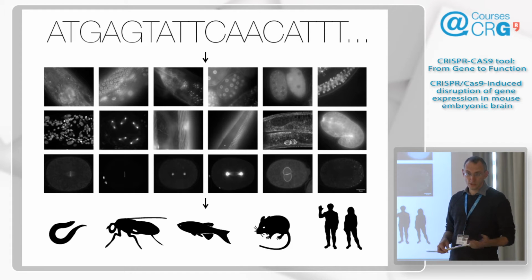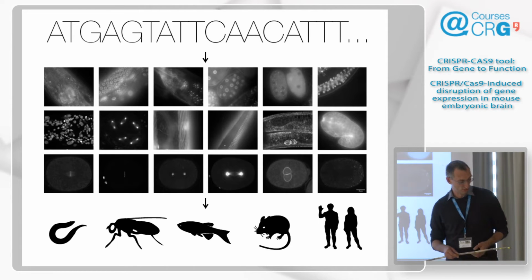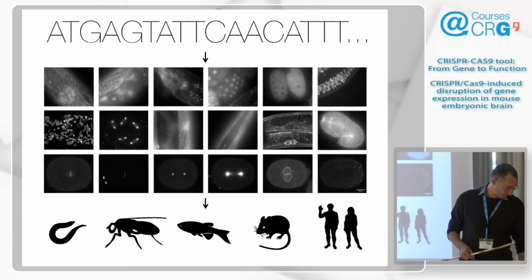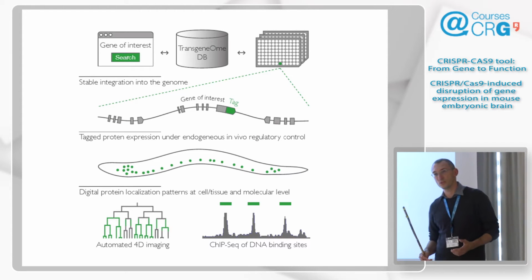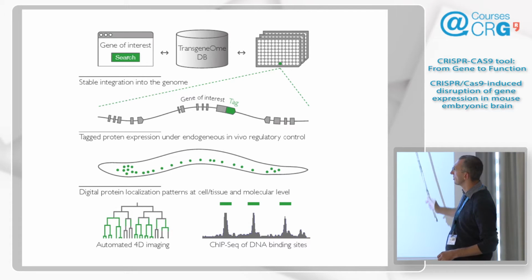And so the alternative that is now almost 30 years old is GFP, obviously, and all the other fluorescent proteins that came after. And through genome editing and variations of genome editing, we are able to attack any protein we want. So that's what our group focused on for many years, was basically to develop resources. This slide outlines what the vision was and what we've been able to realize now for several model organisms: to have a collection where for every gene in the database there'll be a construct.